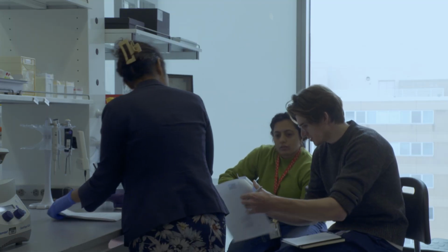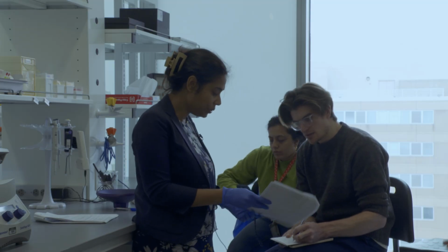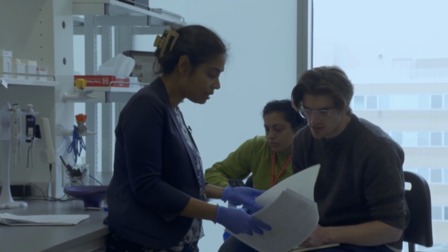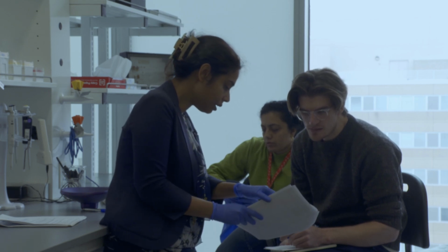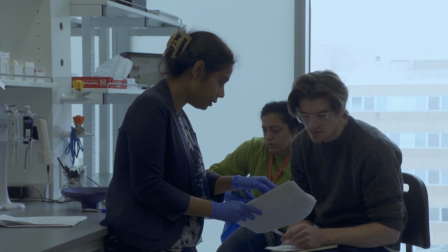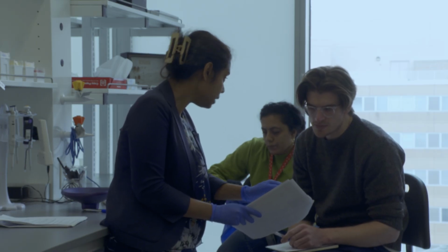Do you want to briefly go through which 3 plasma samples we want? Oh yeah, because all the samples look quite similar, I don't know which one to pick based on what, because everyone has 2 weird peaks. Yeah, exactly. But it looks like this one, this is the upper marker, right? Correct. And let's say this is the mononucleosome peak, although it is not the correct one, but most likely this is what it is.